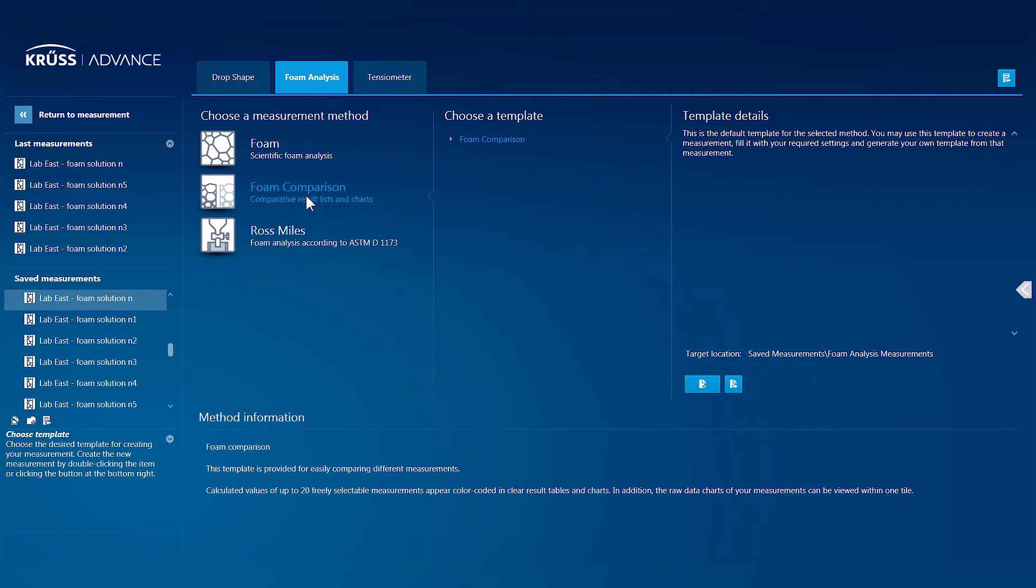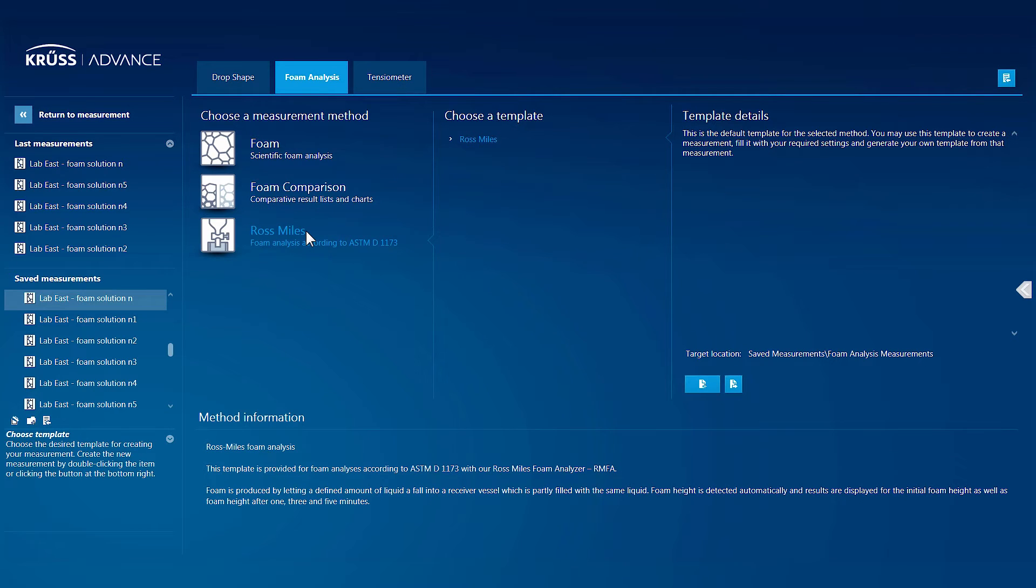Advance comes standard with various templates for each measurement method, which provide a head start in making many of the most commonly used measurements.